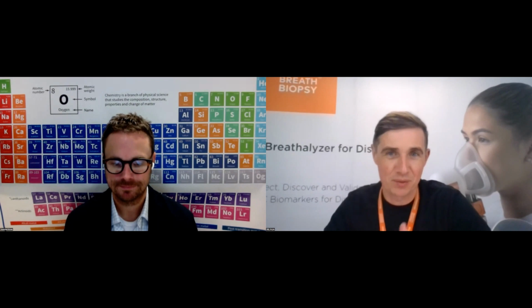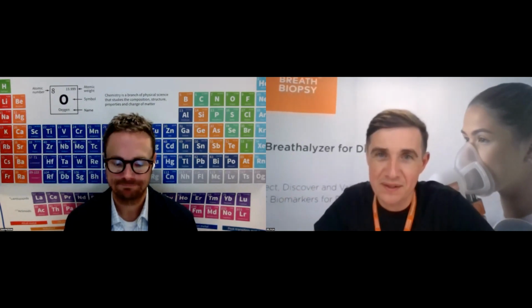And in terms of the materials themselves, sorbent materials, so there's the packing of the sorbent in the tubes. Is there work you think that needs to be done within the field around novel sorbents as well to give capture of VOCs that aren't easily captured with Tenax and Carbograph and those types of things?